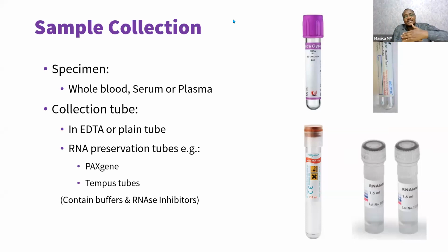And every time they attach, if there is no polymerase to extend them, they will anneal. And then they'll be denatured during heating, and then they can anneal for the next cycle. But once they are used up, then for the next cycle, they'll not be available.